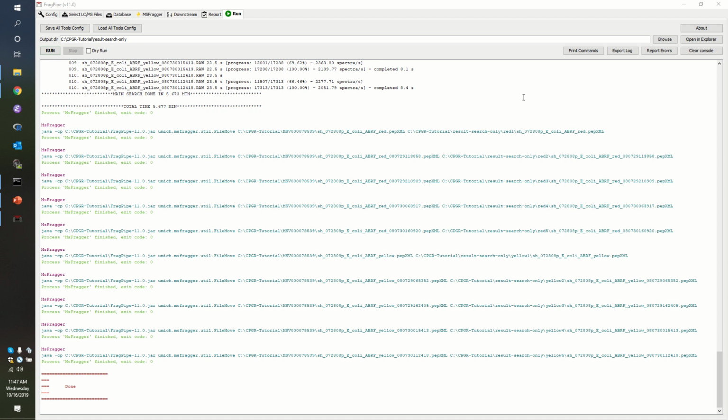If we were to repeat this search with something like Mirror-Match, a search engine I wrote several years back, our software can read raw files through the same libraries that theirs can.